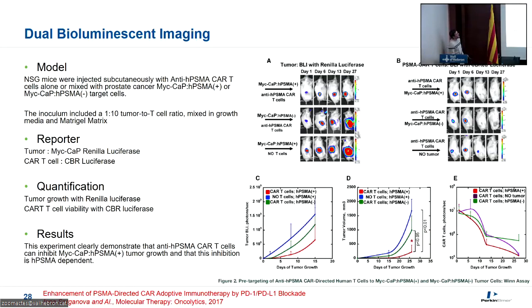And again, in terms of tumor growth, the fact that we are using CAR T cells can really reduce the growing rate of the tumor, which has a higher effect than the CAR T cells with PSMA negative cells, and higher effect than just the control cells. So here we are just looking at the tumor signal, and here we are looking at the T cell signal. They also did survival measurements of the T cells over time to see how many T cells we have every day. And well, they are going down, but it's enough to induce an impact on tumor growth here.